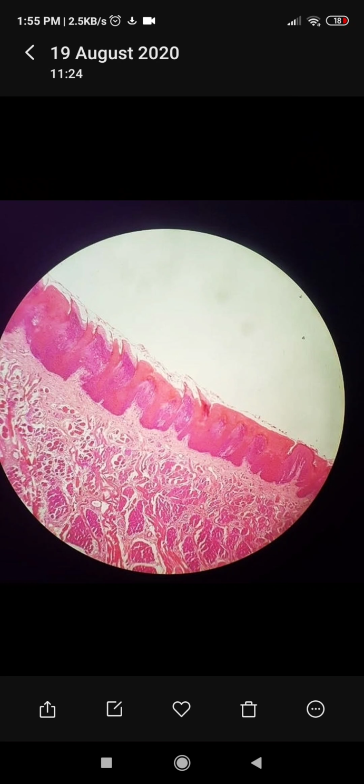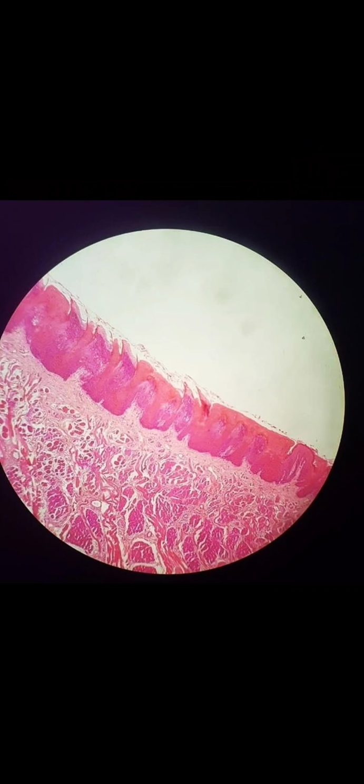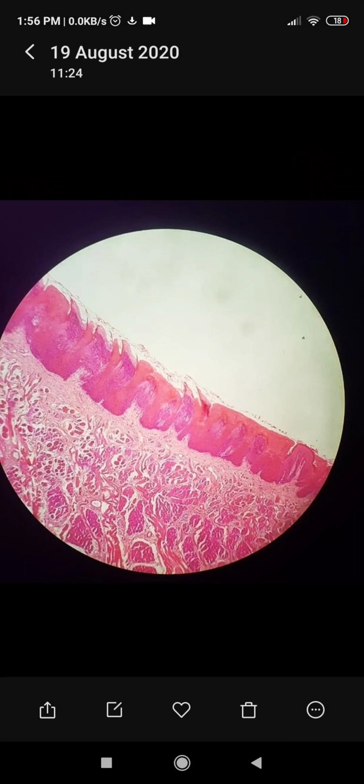The papillae are elevations of mucous membrane that assume various forms and functions. So you can see that this is the dorsal surface, and it contains papillae. These papillae are projections of epithelium.